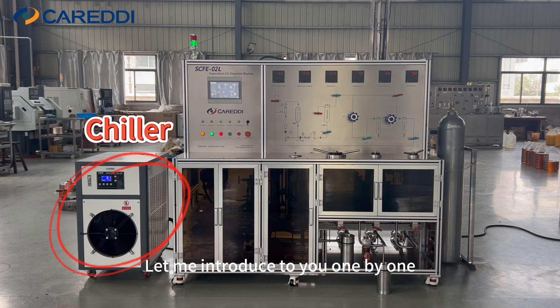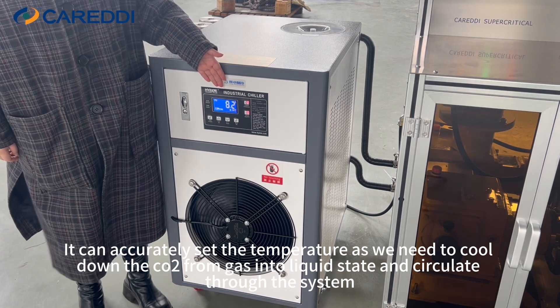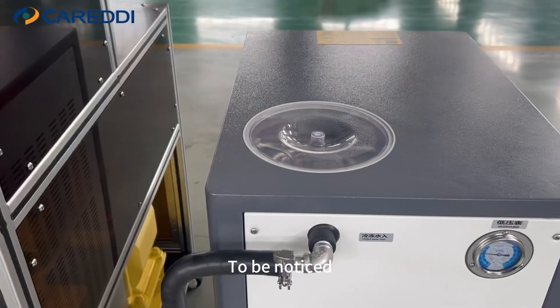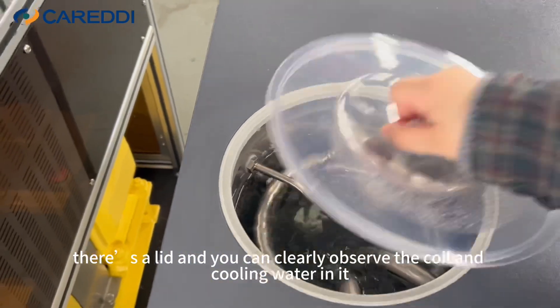Let me introduce to you one by one. First, it's the chiller. It can accurately set the temperature as we need to cool down the CO2 from gas into liquid state, and circulate through the system. To be noticed, for small chillers, there's a lid, and you can clearly observe the coil and cooling water in it.